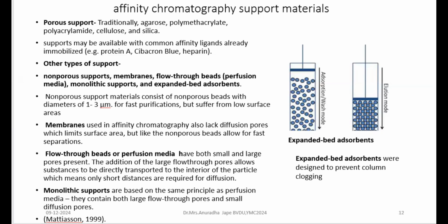Along with these beads, sometimes small analytes also can travel into the interior of the particle. When you talk about direct transport to the interior, that means only short distances are required for diffusion, and diffusion is one of the basic inherent principles that works in any type of chromatography, right? Partitioning is what we had talked about, and diffusion is another thing that is very important in chromatographic separations. Now, considering the limitations of all these, do we have any other types of support matrices with the advancement in the technique?